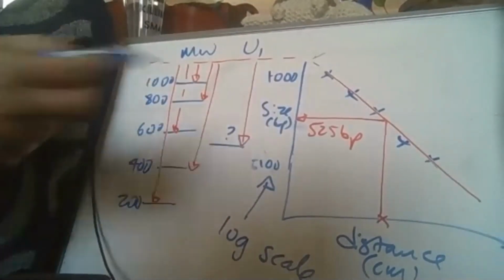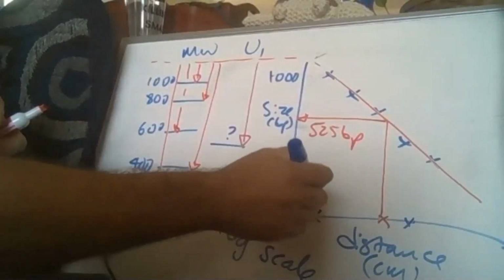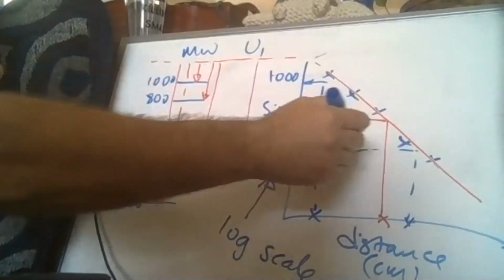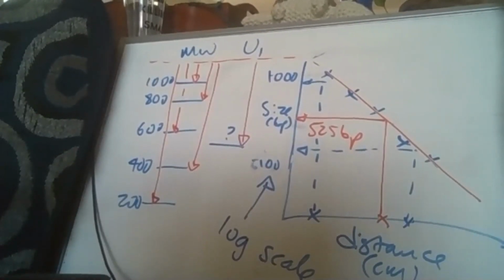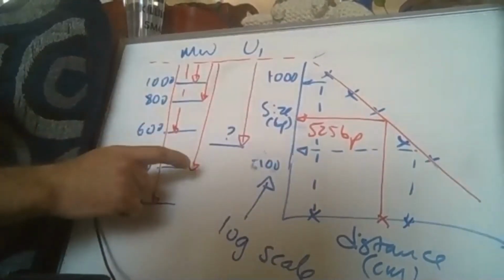And essentially you would get, say, 1 here and 1 here, for example. So you calculate the sizes of the 2 different bands. But essentially, everything you do for 1 marker, right?